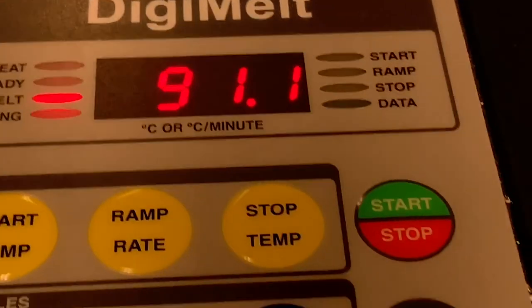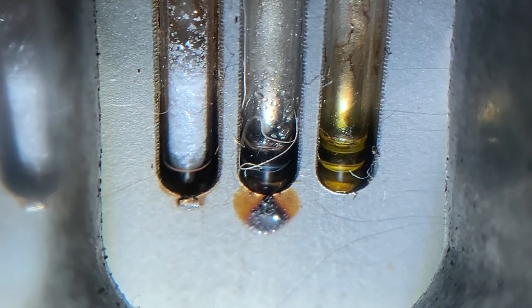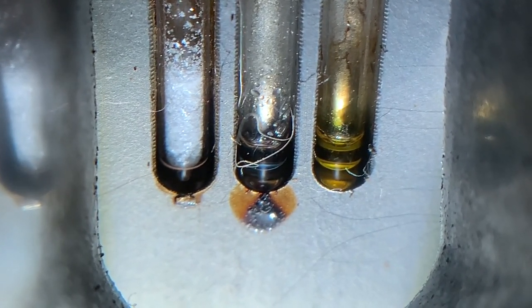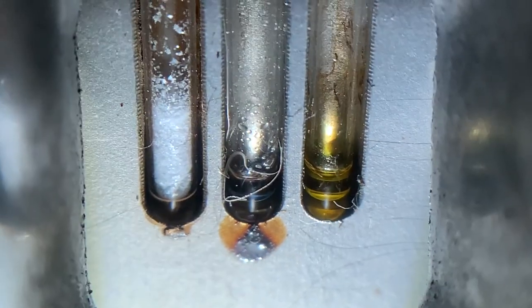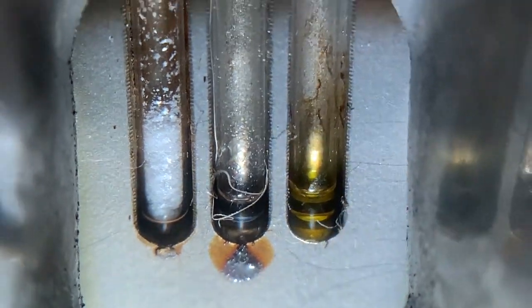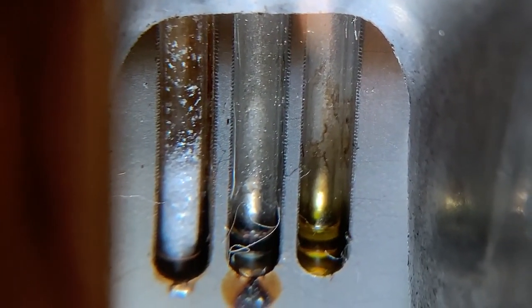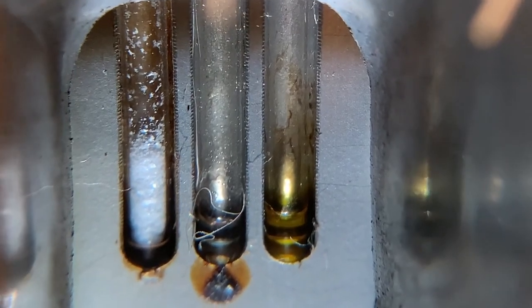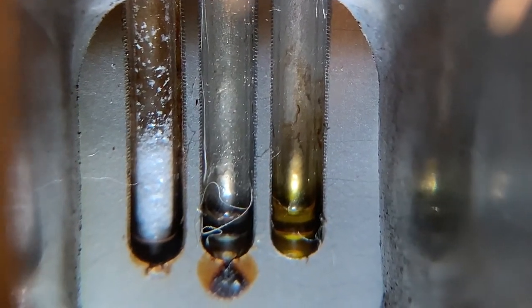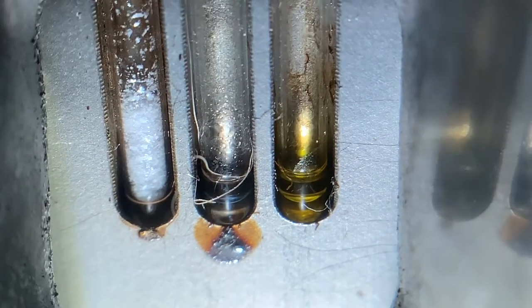It's all dissolved at 91. The ramp rate is a little fast, so it really probably was right on. I'm going to write 91, but if it was at a slower ramp rate, it's more accurate, obviously. So it probably was right on the money, so we could say that's pretty pure. I'm going to up the ramp rate again, because we have a ways to go.